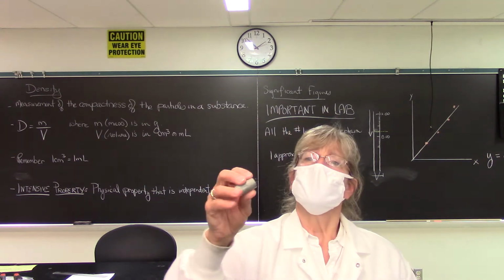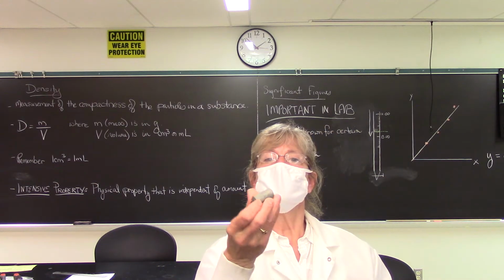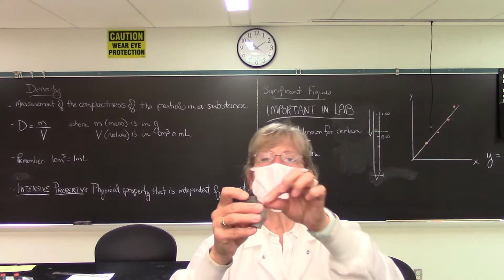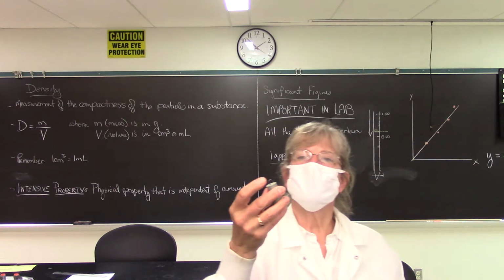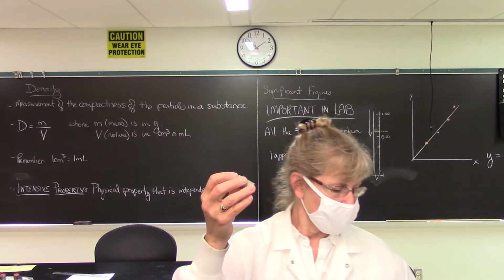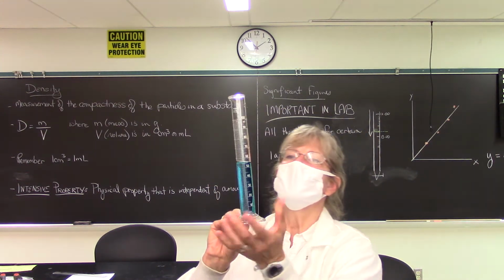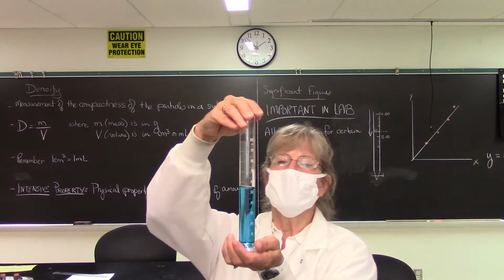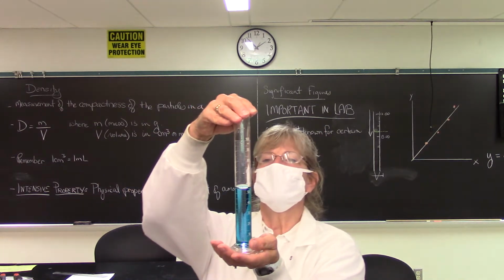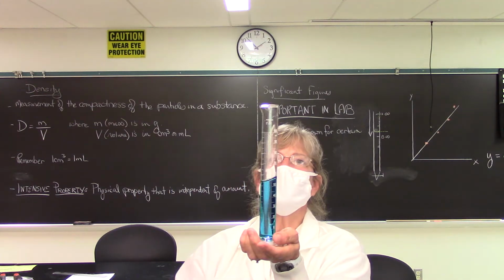Easy enough as far as measuring the cylindrical part, but there are dents and breaks and this little hook. So finding the volume of this by measuring to get centimeters cubed would be virtually impossible. So what we do is we get volume displacement, water displacement. That's how we're going to figure out our volume of this awkward substance.